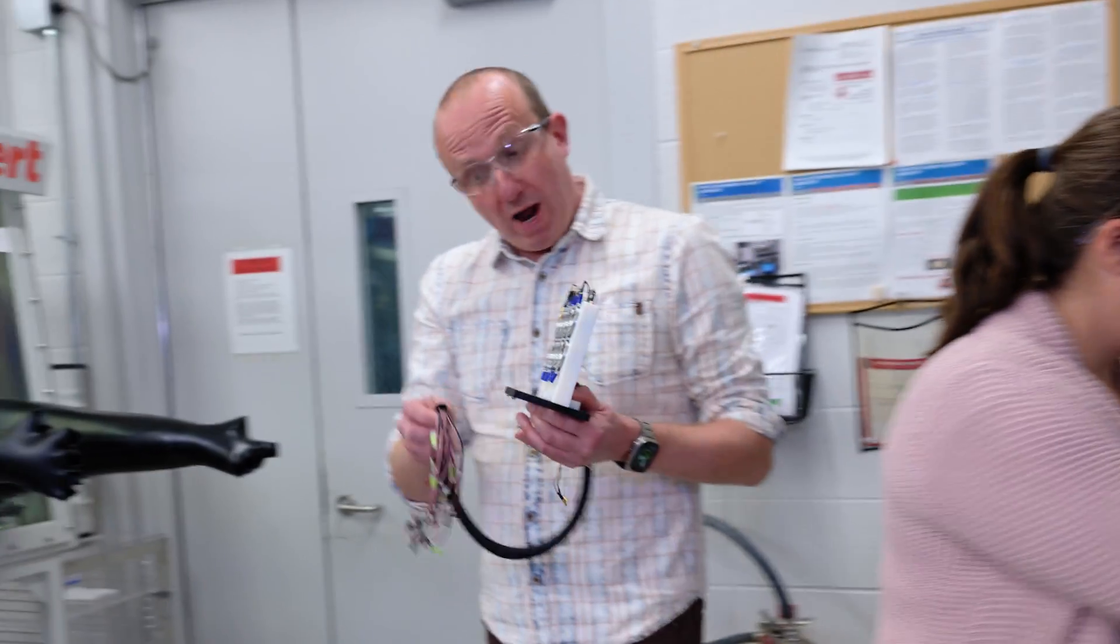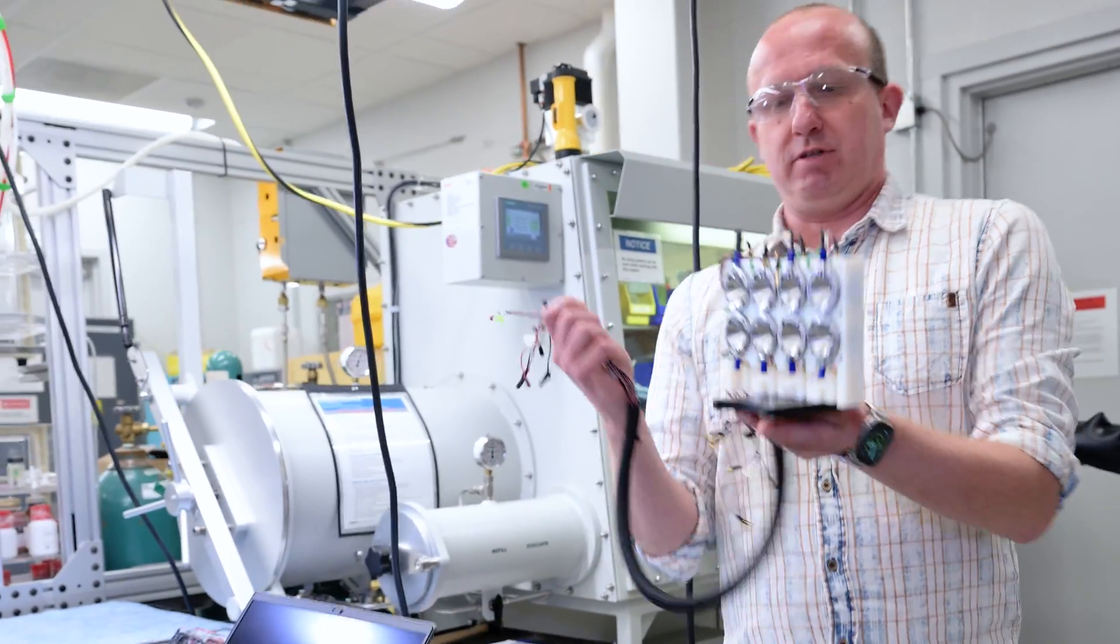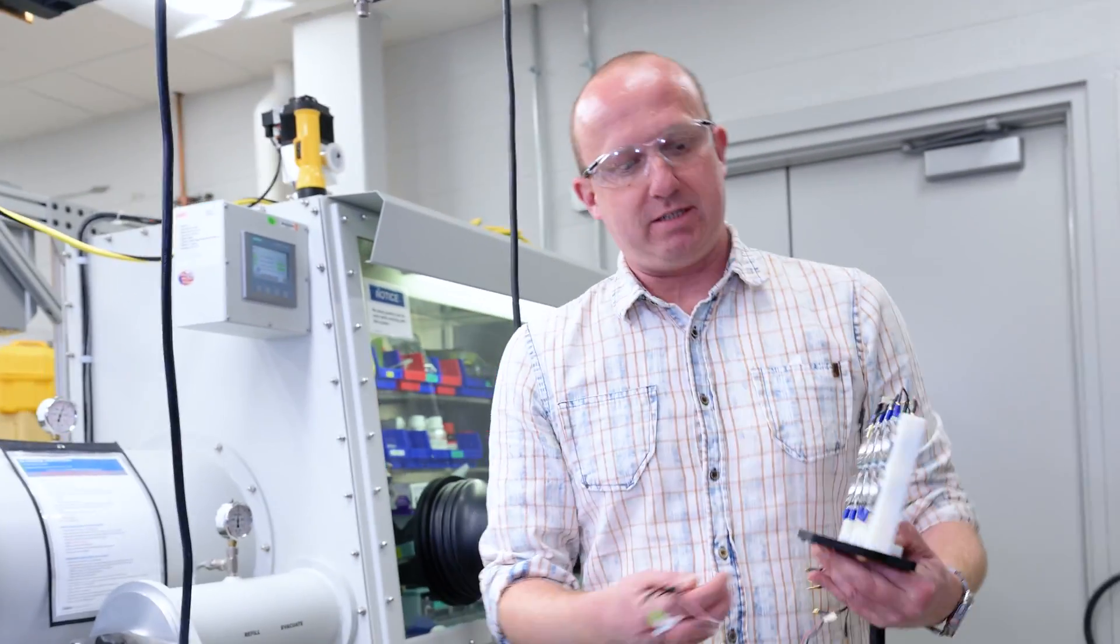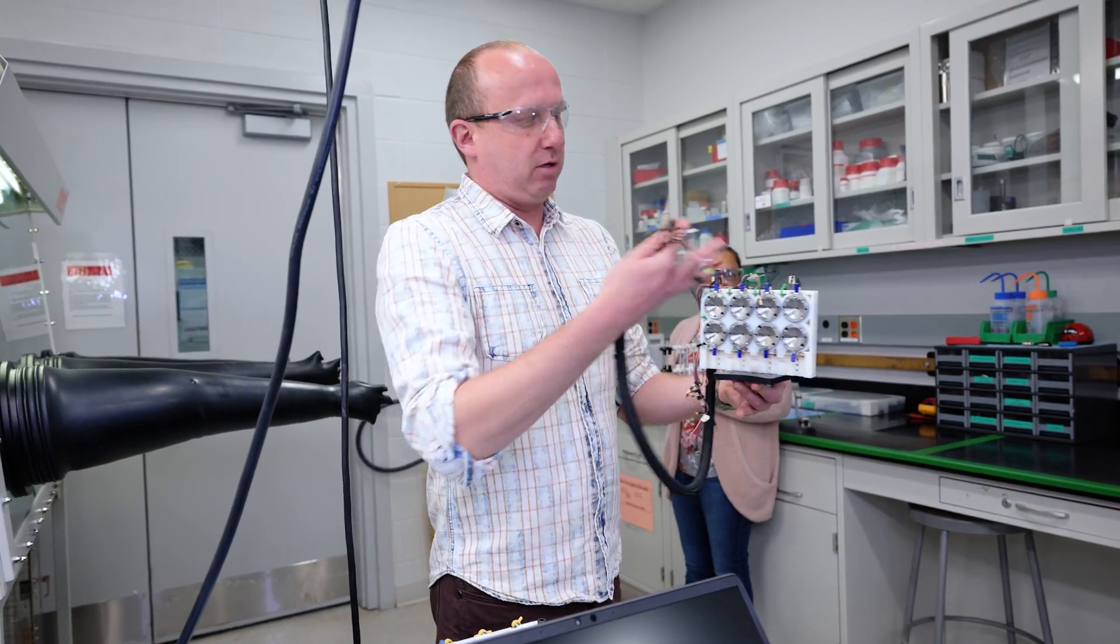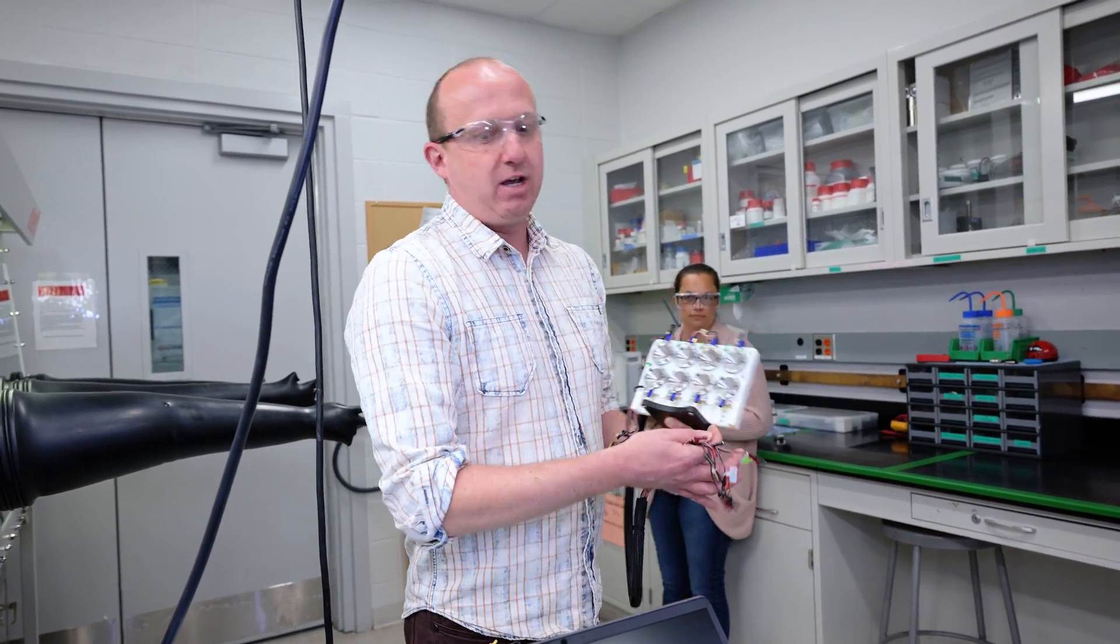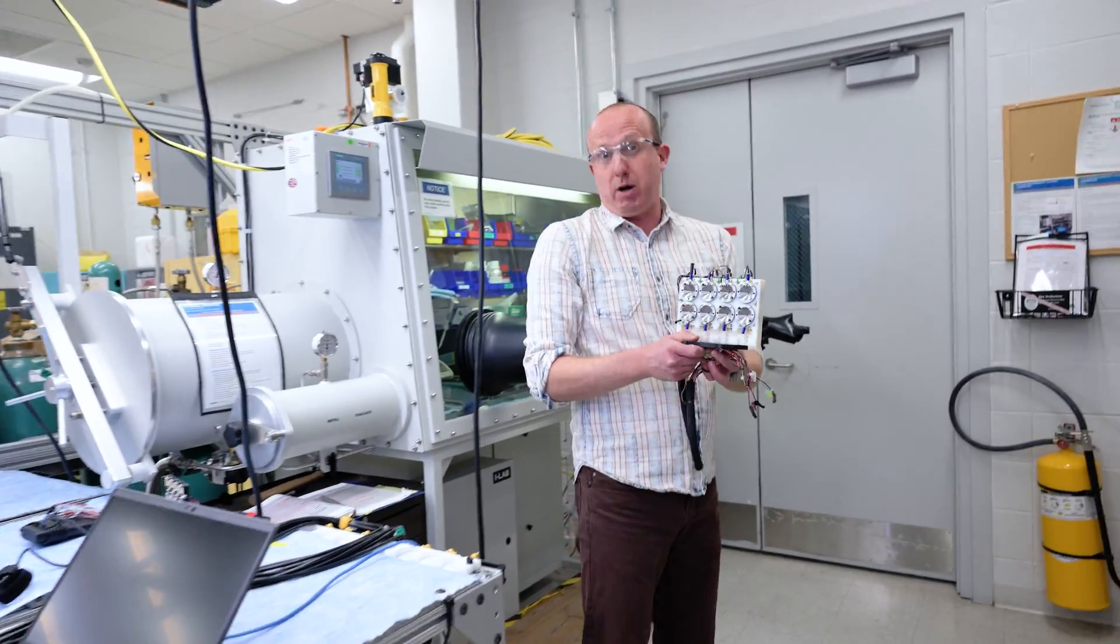We need one more piece of equipment, which is the battery cycler over here. We connect it to our cells, and we're able to charge and discharge batteries while using X-rays to look inside the structure of the materials. You see how they change. We have one of these parked at the beamline, so let's go out now and see how it works.